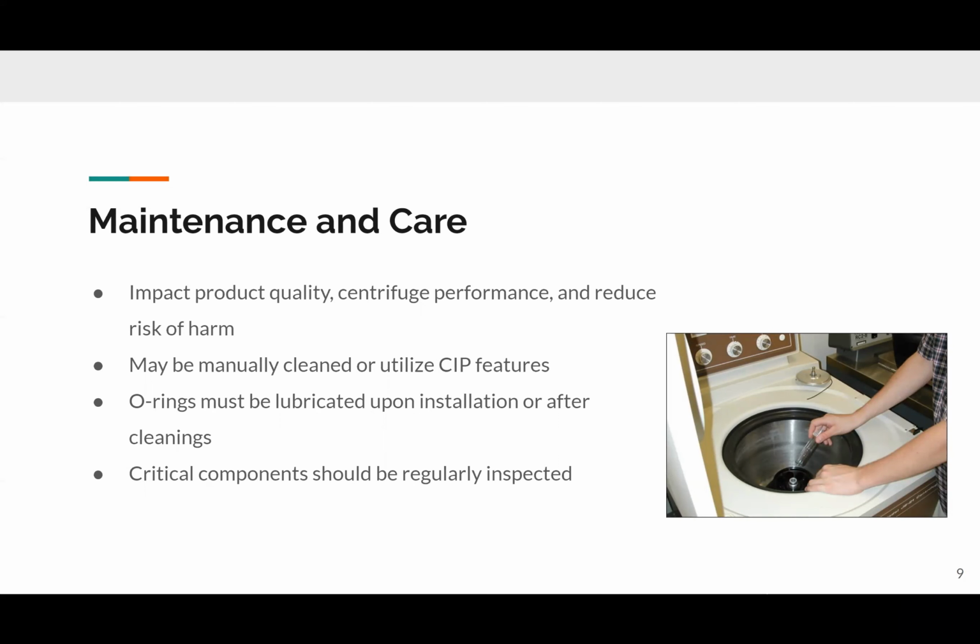For the maintenance and care of the centrifuge, it's important that mechanical parts are cleaned properly and lubricated sufficiently in order for the centrifuge to operate safely and correctly. For example, O-rings must be cleaned and lubricated to prevent sample leakage. Regular inspection for scratches and wear is important because they indicate whether the centrifuge or parts of the centrifuge need to be replaced or maintained in order to restore centrifuge function. By maintaining and caring for the centrifuge regularly, high centrifuge performance and quality outputs can be attained.